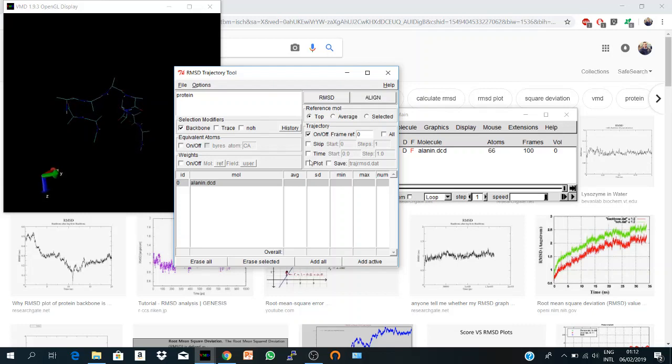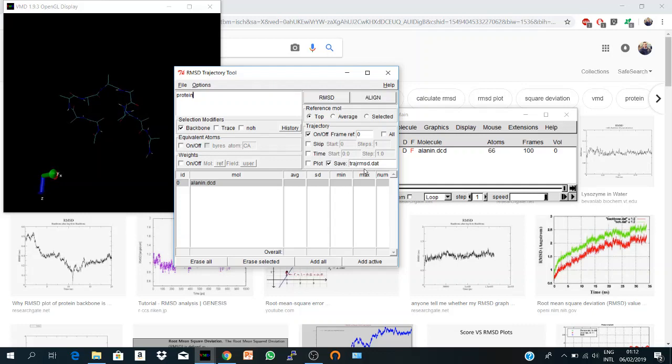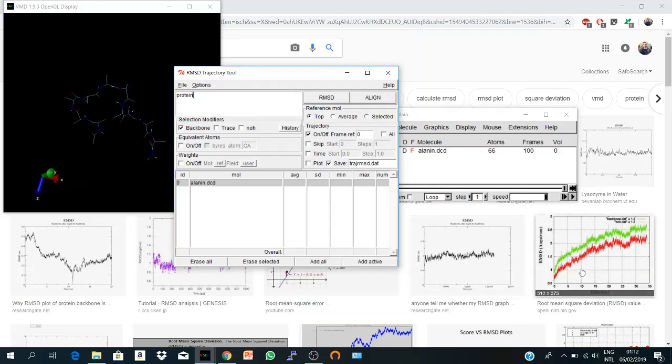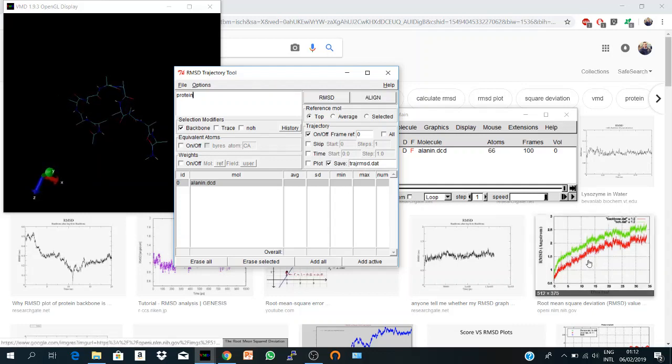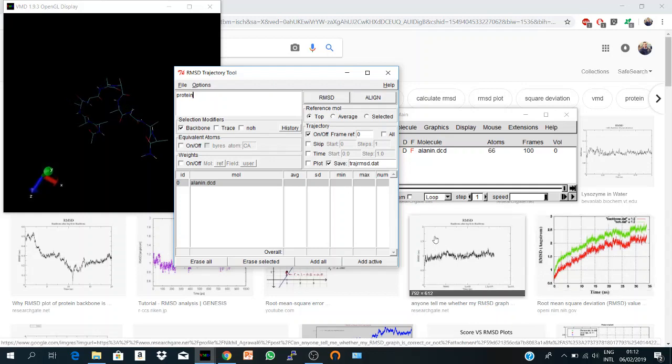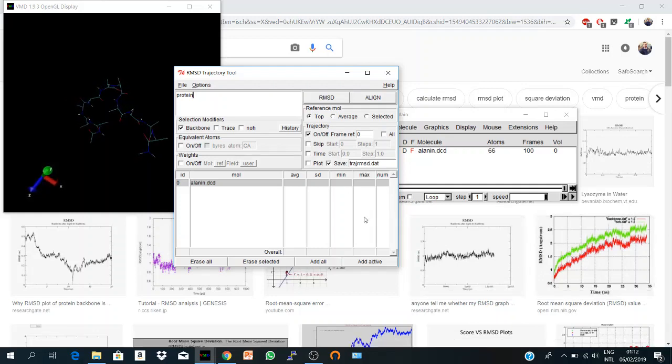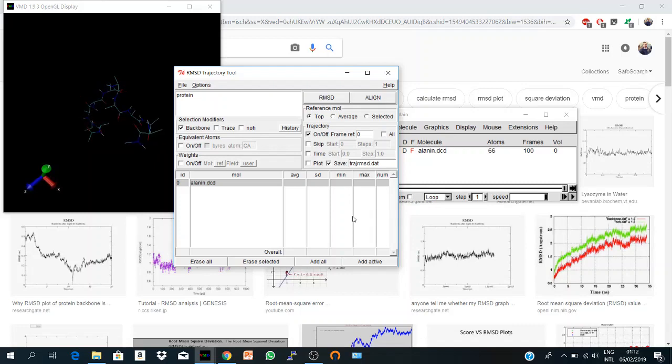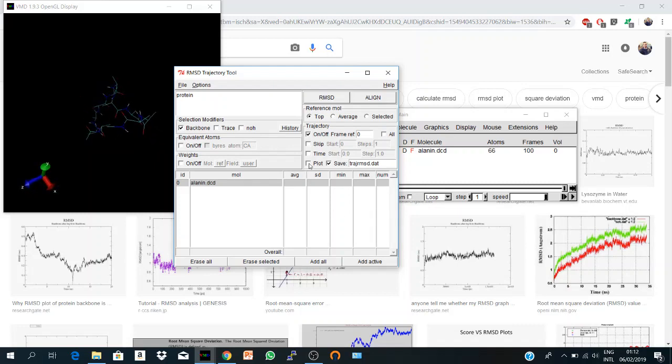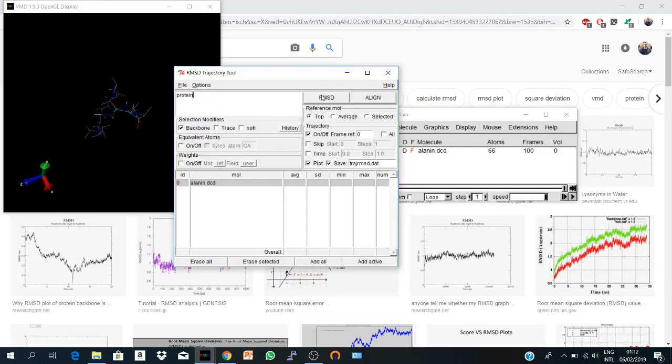Here you should save your RMSD values to a text file so that you can plot again and get a nice figure using any other program. But also, VMD can give you a quick plot to have a look at your system. You can also say plot, so VMD will calculate, save, and plot.